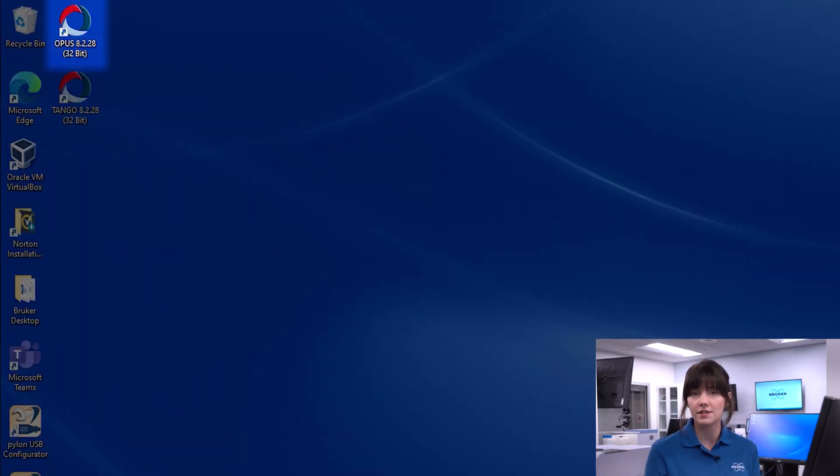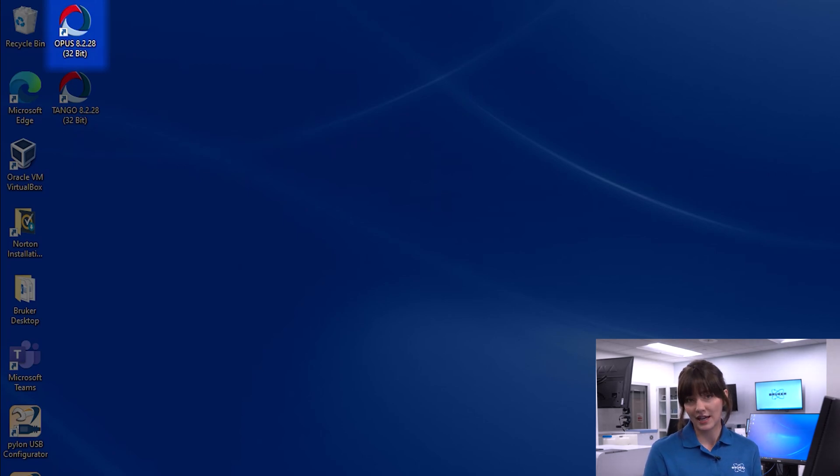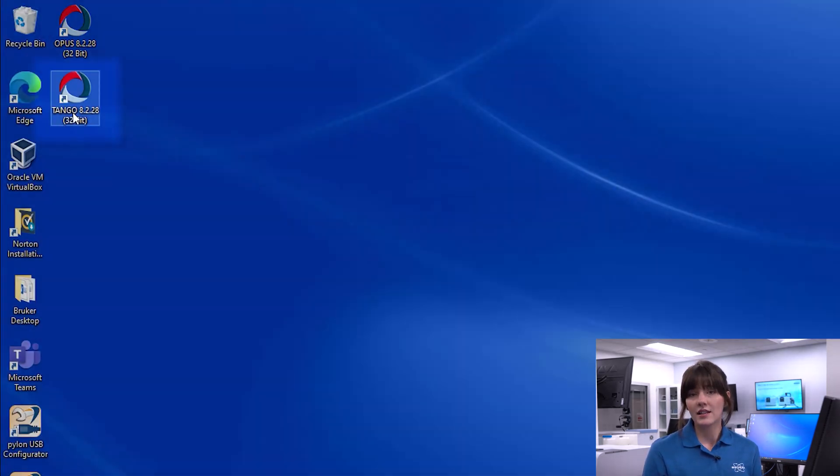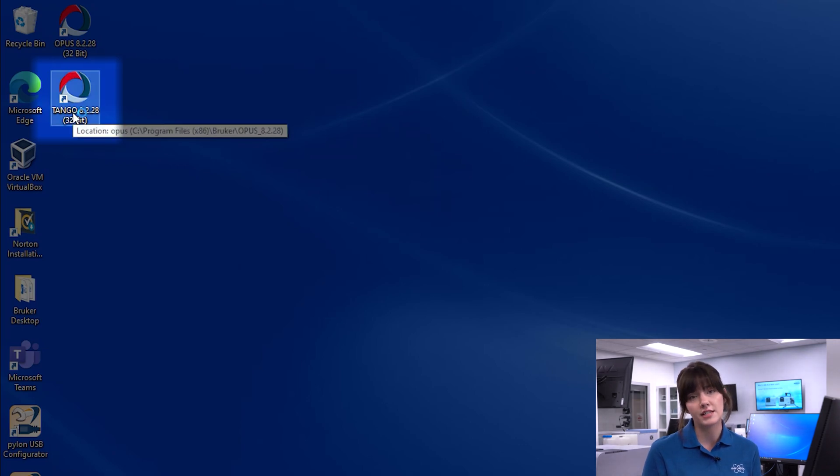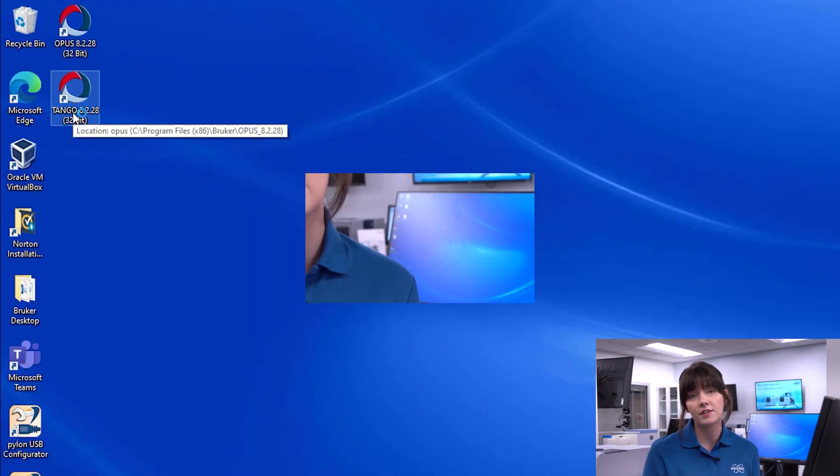There are two software packages associated with our Tango. The first is Opus, which is the package where we create calibrations and run spectral analyses. The second software package is called the Tango GUI, which is our graphical user interface, and this is what we often have customers utilize because it's very intuitive and easy to follow along.